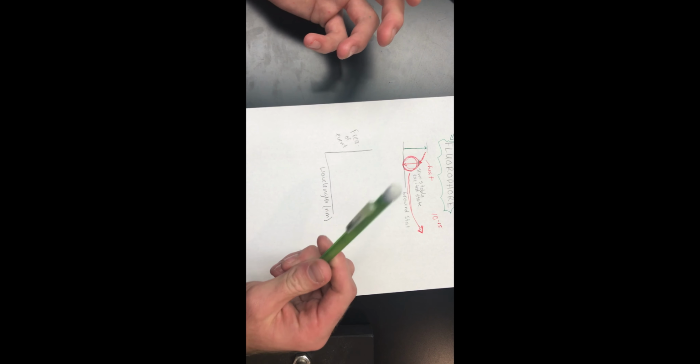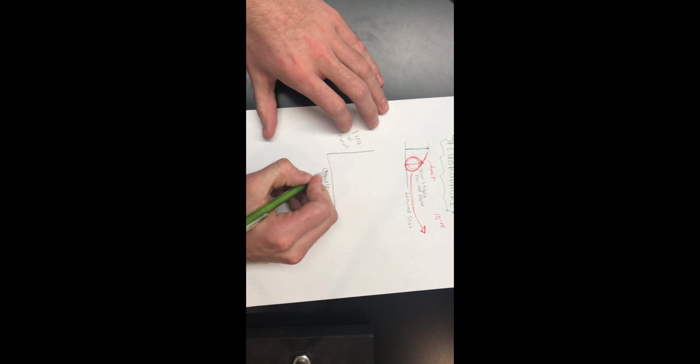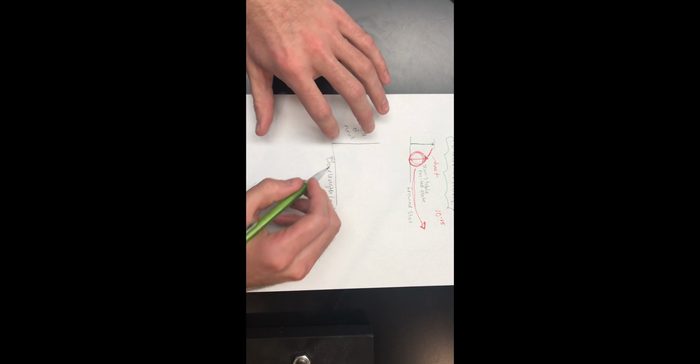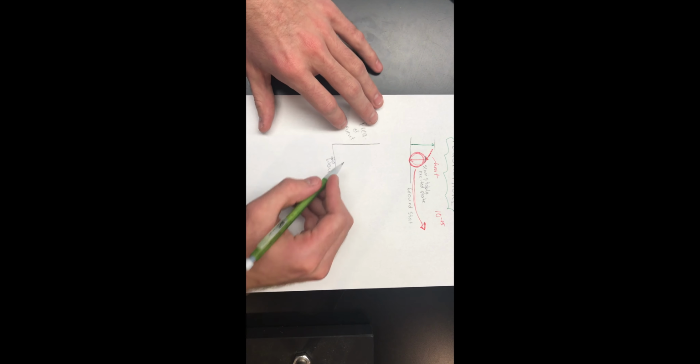Just as an example, let's take a look at Evans blue dye. This is a very commonly used dye. It has a very high affinity for plasma albumin. Evans blue dye is excited at a few different wavelengths, but its optimal excitation wavelength is going to be 620.